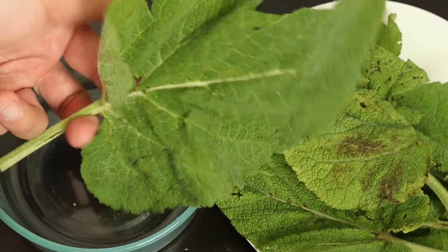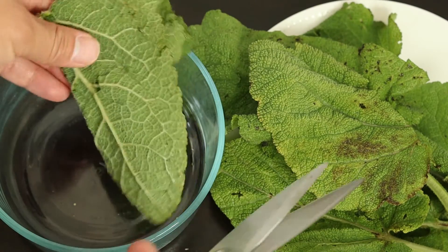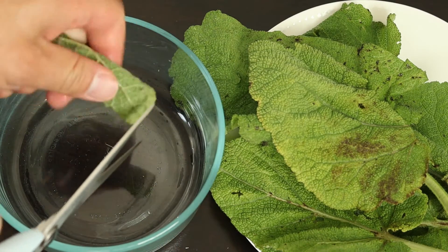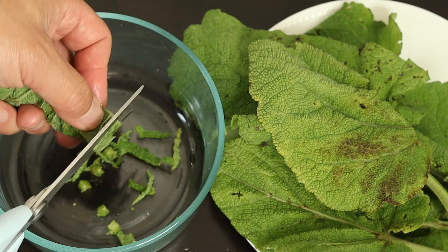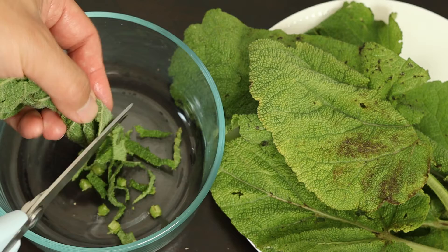After harvesting the clary sage leaf, pretreatment is important. I use scissors to cut it into small pieces. The smaller pieces make extraction better. You don't want to use a very strong blender to blend it into liquid — you just want to cut it into small pieces.